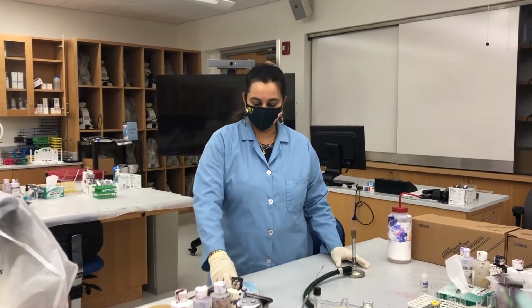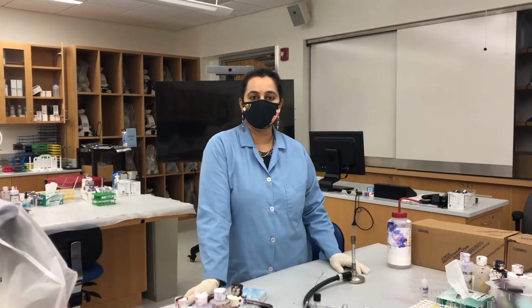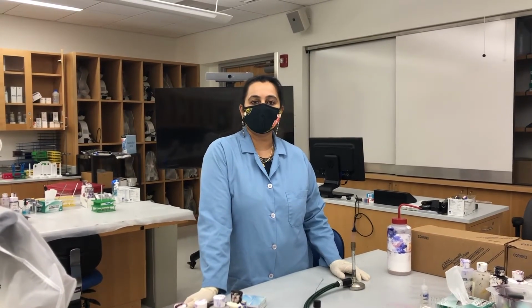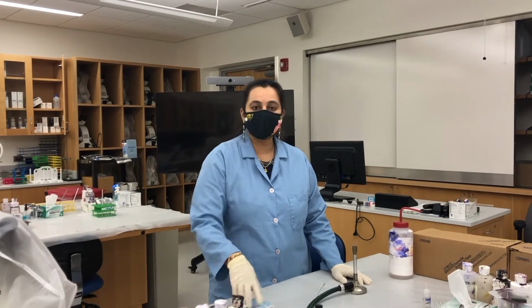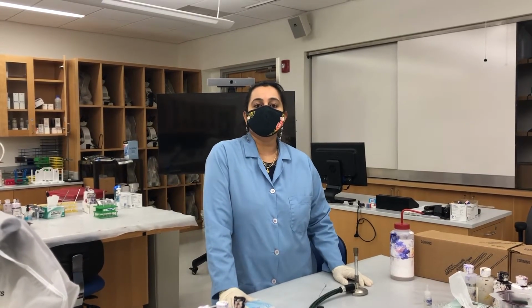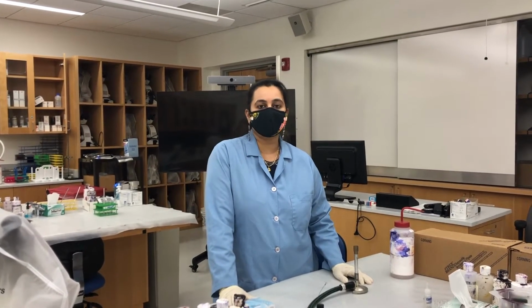Hey guys, today we'll be learning about the staining techniques. So your second lab exercise has gram staining technique. Gram staining is a technique used to differentiate the gram positive bacteria from gram negative bacteria.